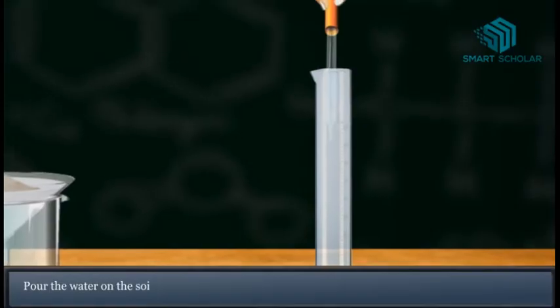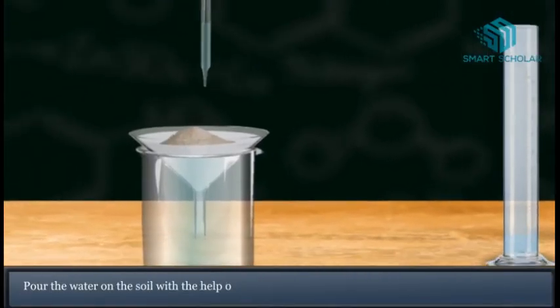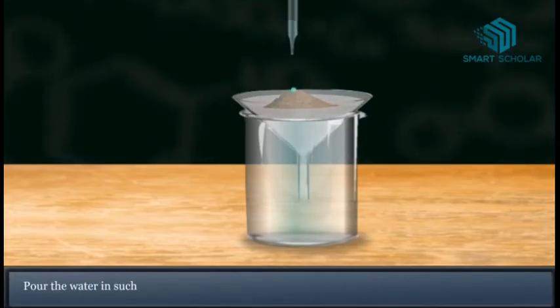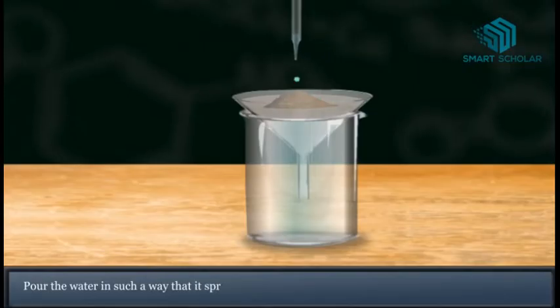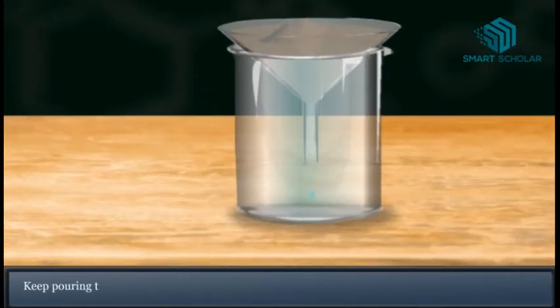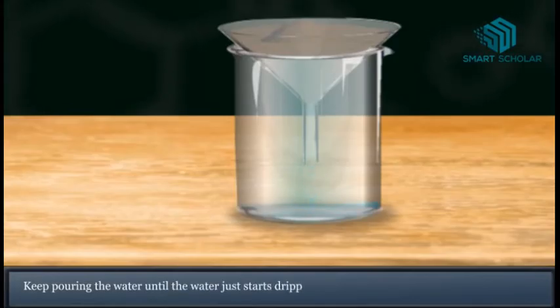Pour the water on the soil with the help of a dropper. Pour the water in such a way that it spreads over the entire surface of soil. Keep pouring the water until the water just starts dripping from the funnel.